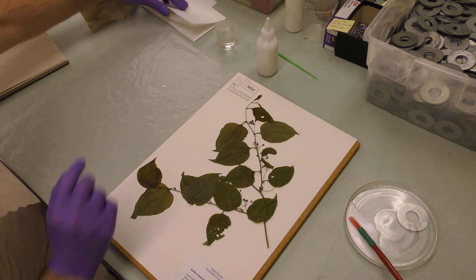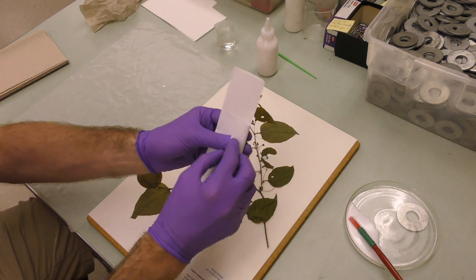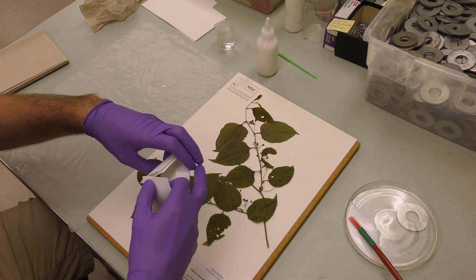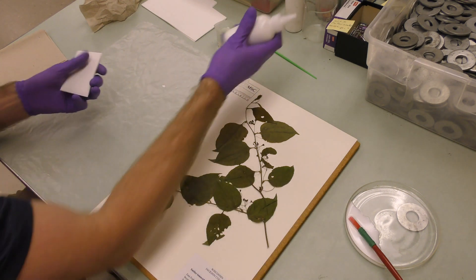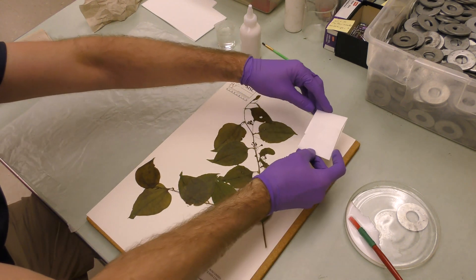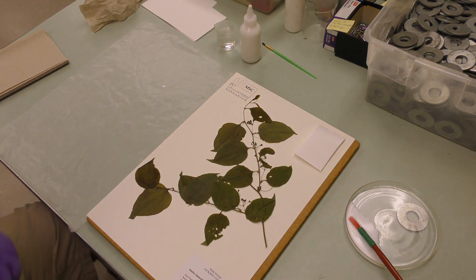We include fragment packets with ours. You can see these little packets here — if you get to do a little bit of origami, ours are pre-folded. These are for if any pieces fall off as the specimen is stored or as people are using the specimen; they'll have a place to put those pieces. That's pretty quick — this isn't like gluing the plant. Just put that on there and find where it's going to fit. Now we're ready for wax paper.